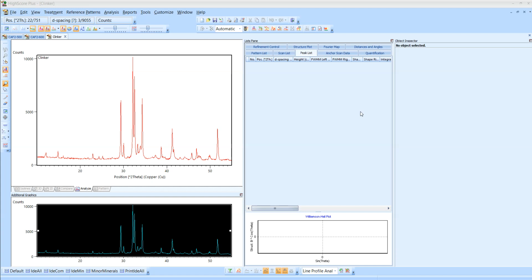In the first steps, if you want to plot your XRD pattern in Origin software or use this data in your article, you have to convert the typical format of XRD patterns into ASC format. Because we have to convert it into a specific type of file containing numbers or values, which is useful for your x-axis or y-axis in your plot.